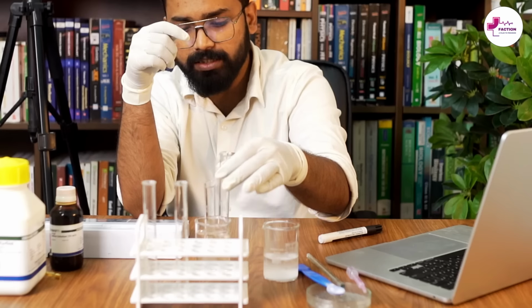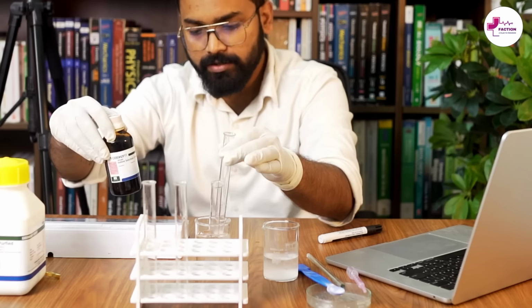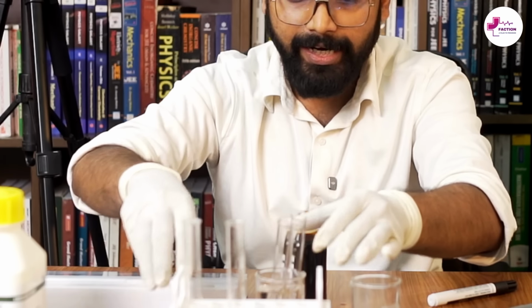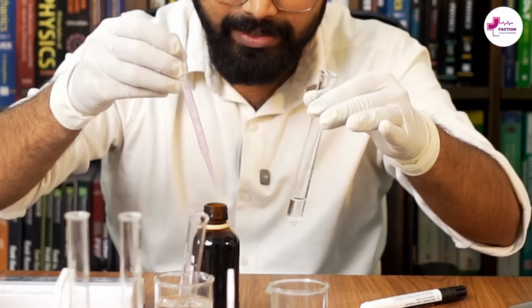So this was the test tube that was without amylase and this here is an iodine solution. At first I will add iodine solution to this test tube which did not have any amylase.